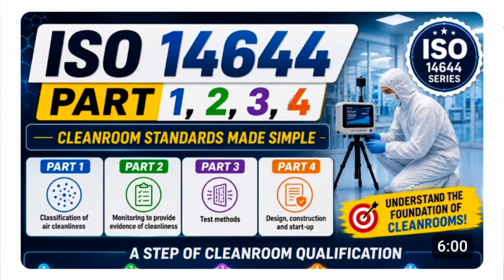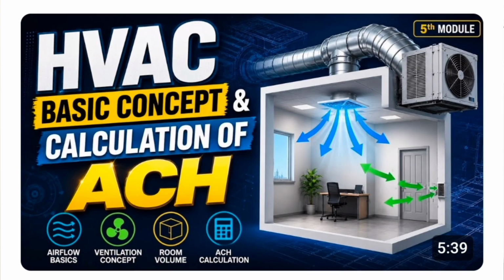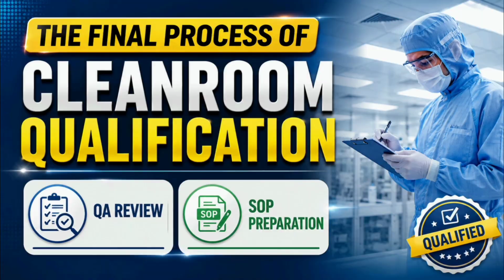In our previous videos, we already discussed the ISO guideline, EU GMP guideline, and operational qualification tests such as air velocity test, ACH calculation, filter integrity test, smoke study, etc. In this video, we are going to discuss the final process for cleanroom release for intended use. What is the process after completion of IQ and OQ?